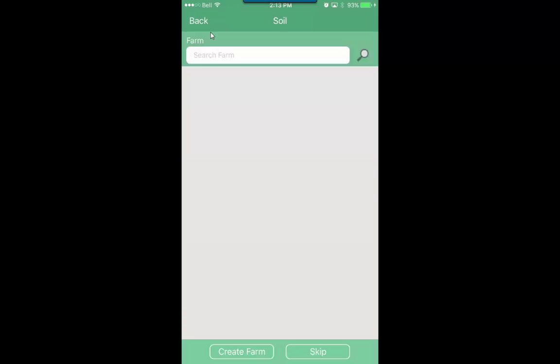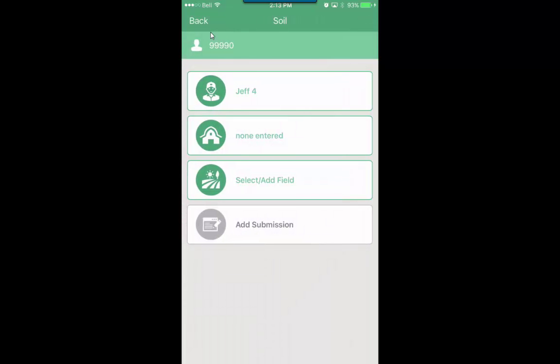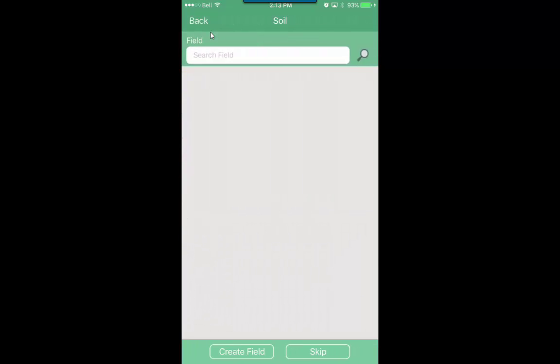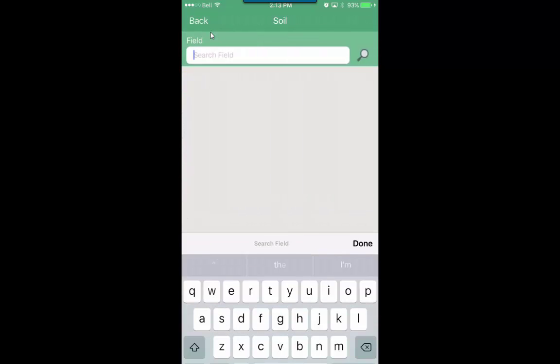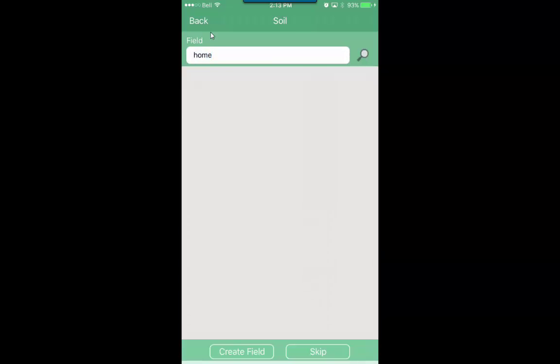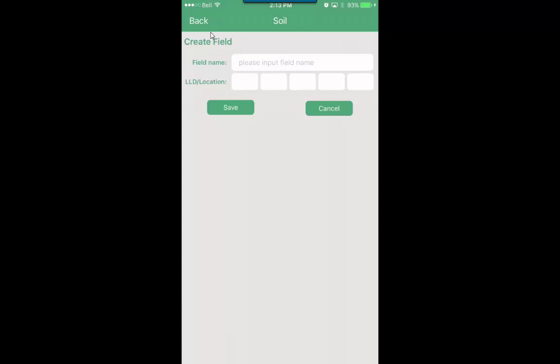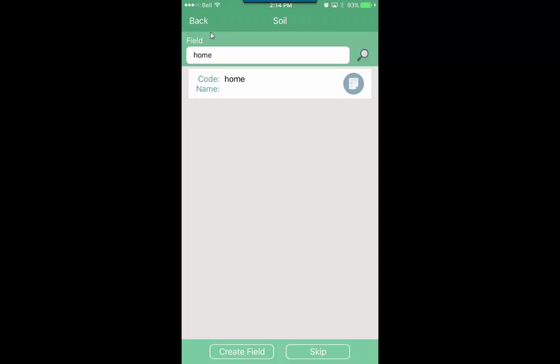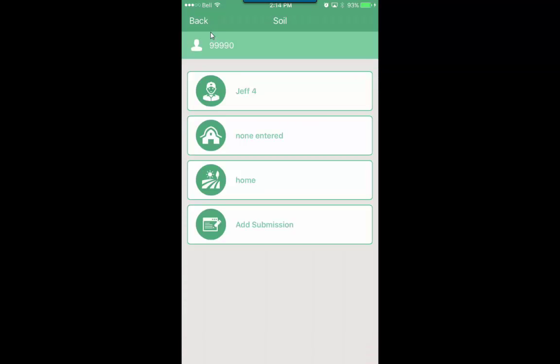We can add a farm. If you don't have a farm name, we can always skip these steps to the bottom right. You'll see skip. Go add a field. You could add a field name if you wanted or we can again skip. So we'll create this field. You can input a legal land description if you have it. So then we'll select that field.